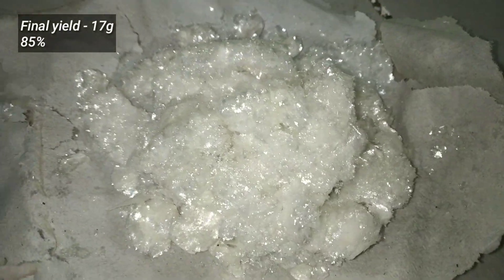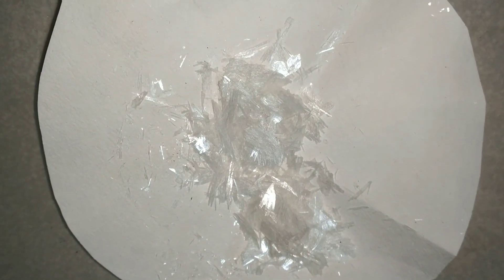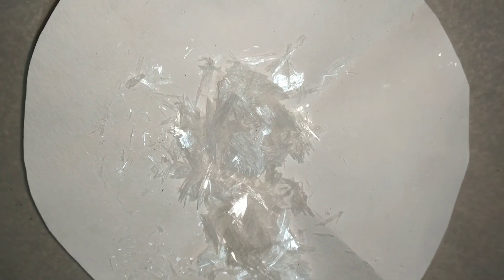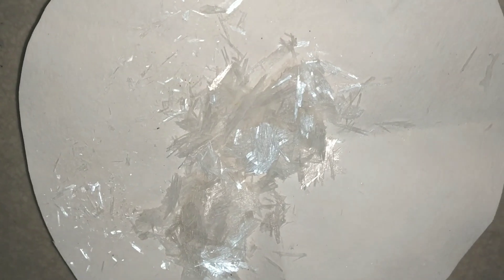This is the final yield of benzoic acid, which weighed around 17 grams — that is about 85% yield. And these are the needle-shaped crystals obtained in the round bottom flask. The product was then stored in a tight bottle and labeled.